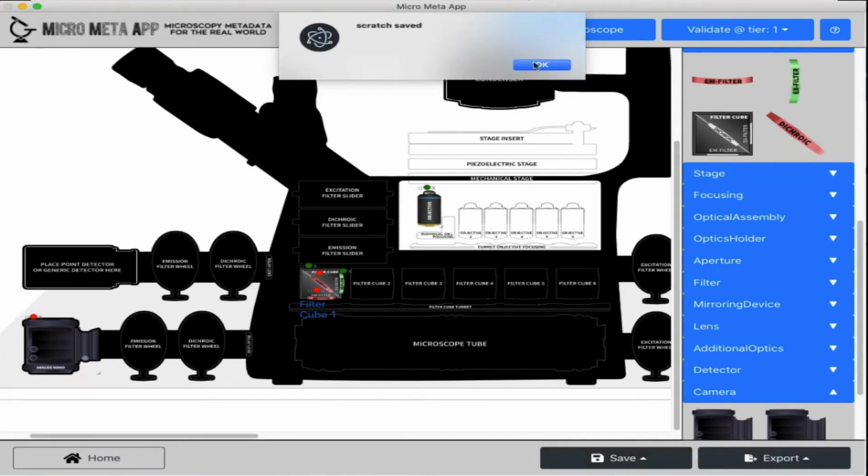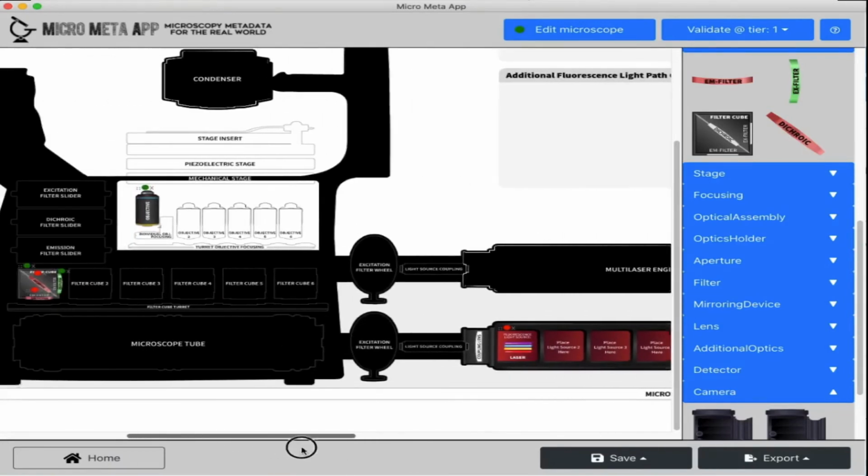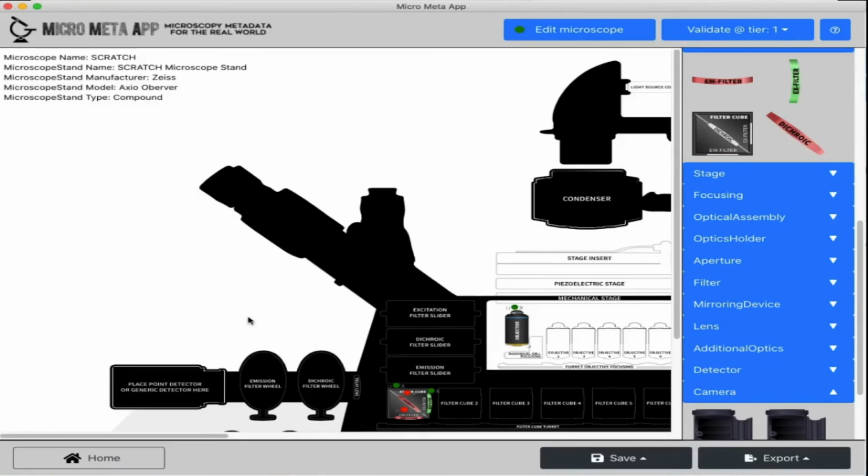Because of lack of time, I'm not going through all the different hardware components, but I hope that this is clear enough. In addition, if you have more questions, you can contact me and I'll do my best to help you with your documentation tasks.